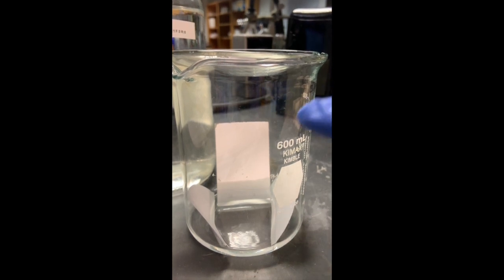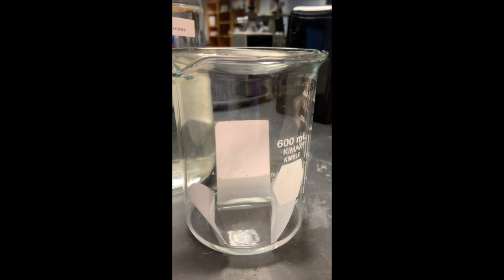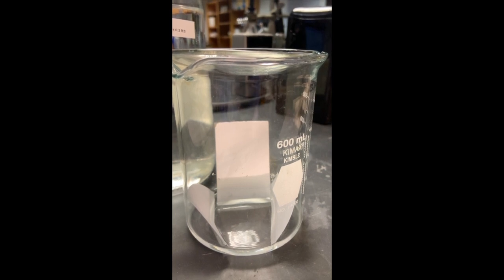And then when it gets closer to the top, I'm going to take it out. So when it's maybe 1 or 2 centimeters from the top, I'm going to remove the TLC plate, draw a line on the TLC plate because that's my solvent front. I'm going to bring it over to the fume hood to dry out, and then I'll visualize it using my UV light.